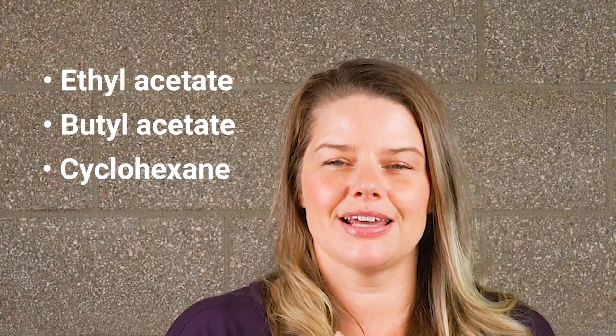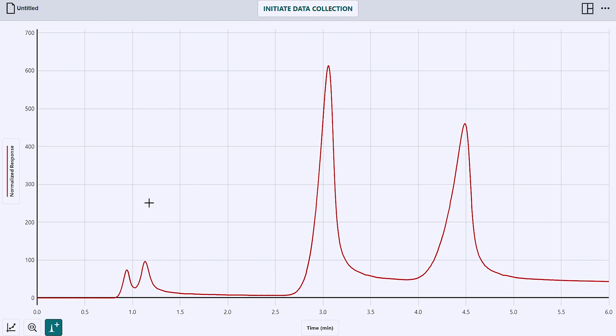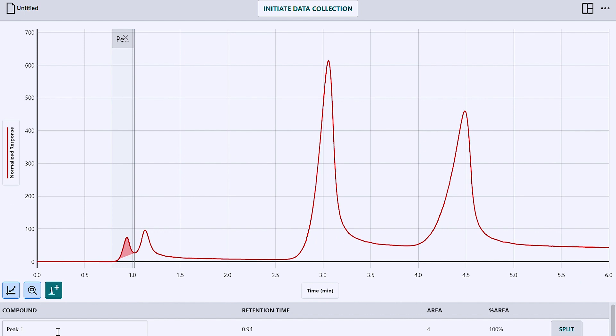All four compounds have eluted. I injected ethyl acetate, butyl acetate, cyclohexane, and toluene. They should have eluted in the order of increasing boiling point. My first compound here is ethyl acetate. To determine its retention time, I can use the statistics feature, but we also have a built-in peak integration tool. I select my peak and then click add peak, and there it is. I can change the name of the compound and I can see the retention time right in the table below. I just repeat this for all my peaks.